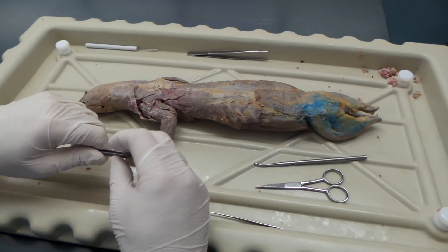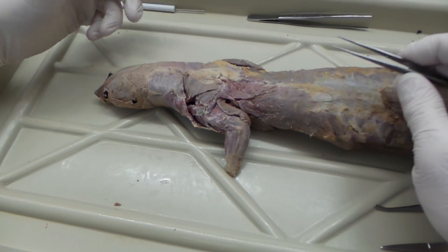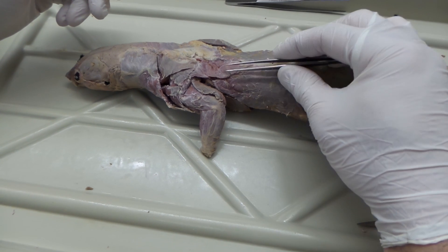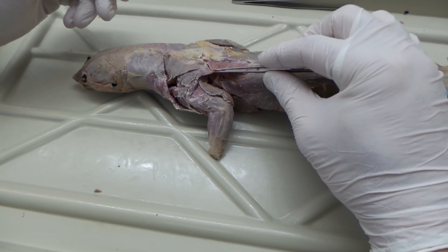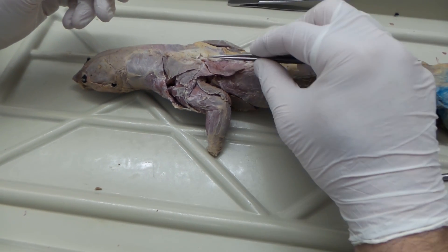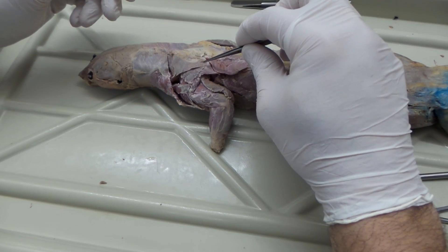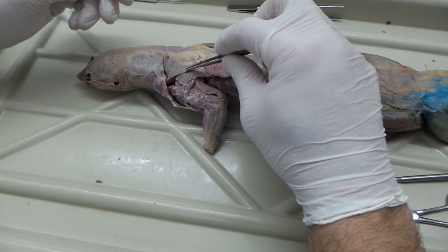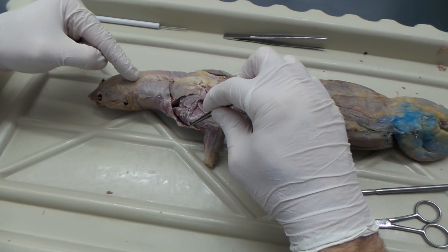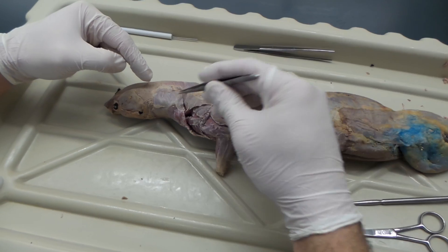The first muscles we're going to look at are the trapezius muscles. Unlike humans, mink have three — same thing in cat. The first trapezius muscle, working up, is the spinotrapezius. The next is the acromiostrapezius. The last runs right along down to the shoulder — that's the clavotrapezius. So we have spino, acromio, and clavotrapezius.